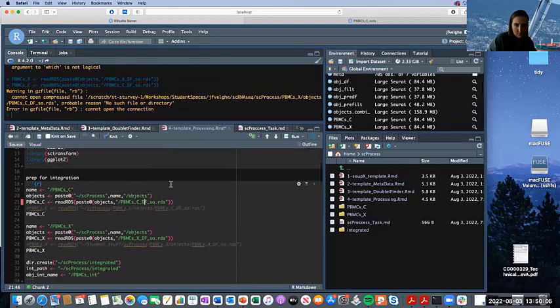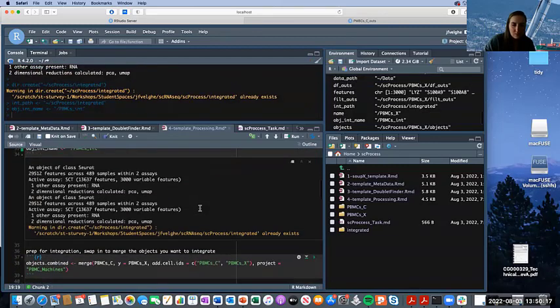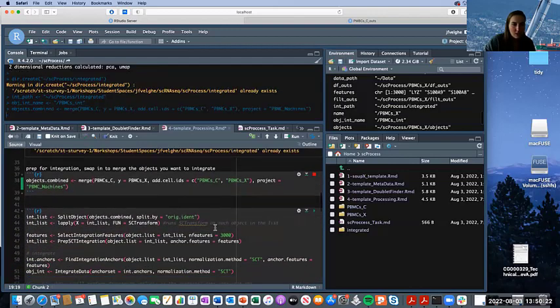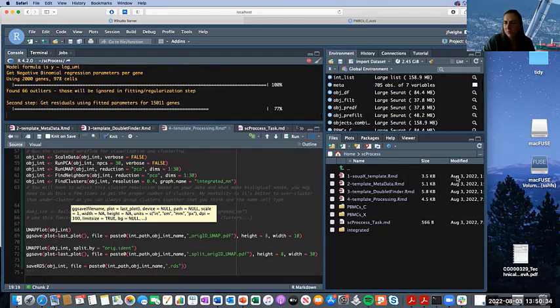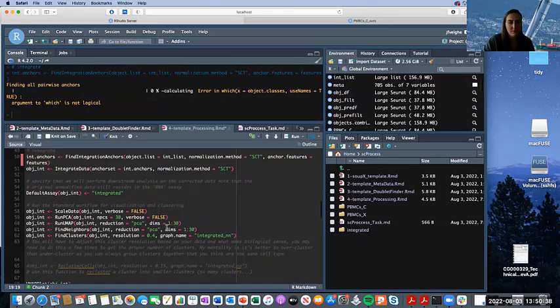Is someone in the chat? Yeah, let's see what's up in the chat. Oh, good. Okay, it's working for you. Someone probably missed a block. I either missed a block or I don't think I missed a block, but we'll run it. Okay, ran good for you guys. We know that exists. That's the fine warning. Okay, I'm going to hit run again. Daniel's giving me hope. Okay, can I get a thumbs up that it worked for others? Might just be a me problem. Yep, good. I gotta trust my code.